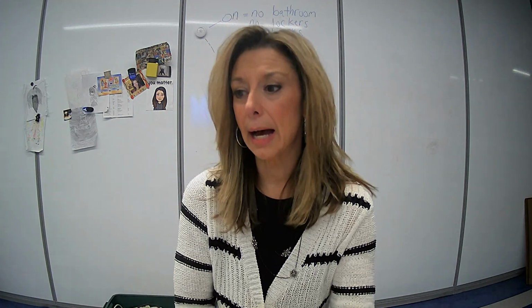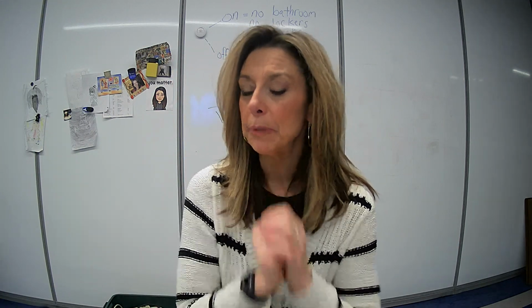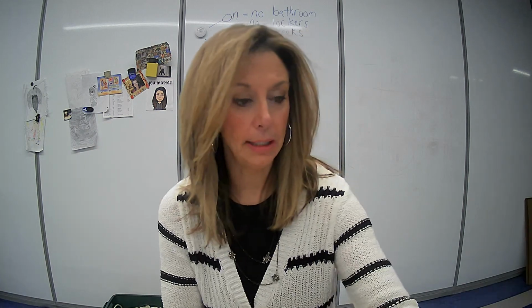On slide 8, it's going to give us the directions on how to do this lab. This is a mass volume relationship. We're going to need a massing scale. We will need a graduated cylinder right there, and then some cylinders.